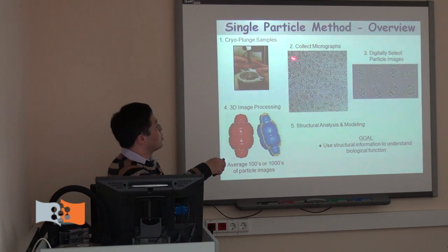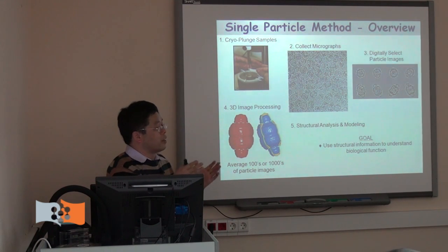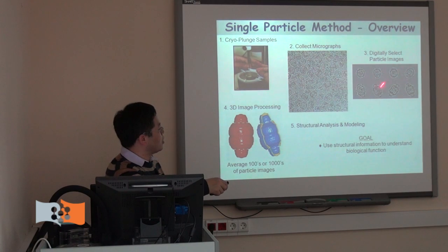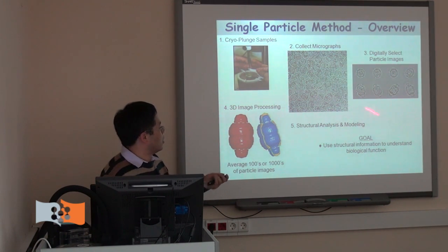Then we pick a lot of these particles and average them to enhance the signal to noise ratio, and we treat each cluster average as a different projection image. Then we do the reconstruction. The goal is to get the 3D information of the object.